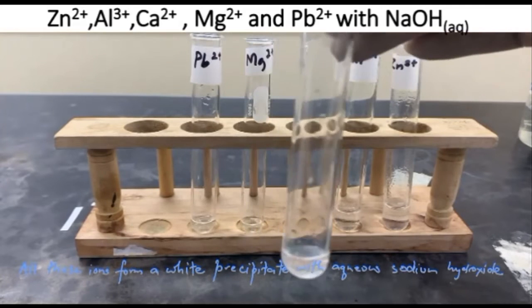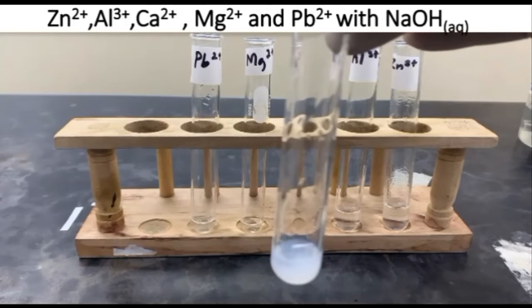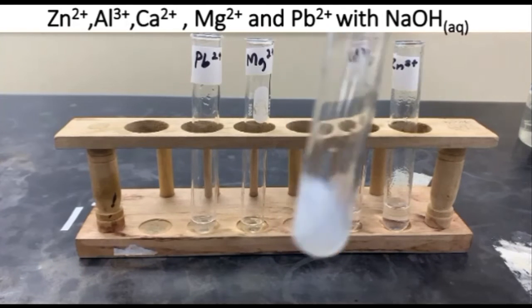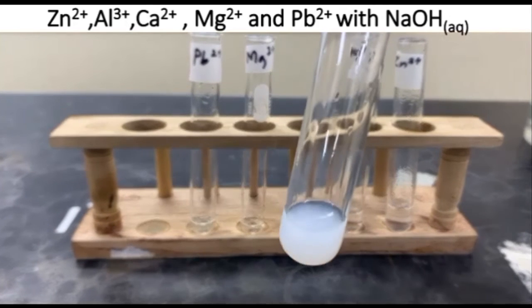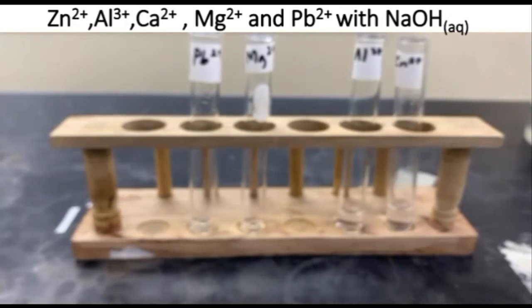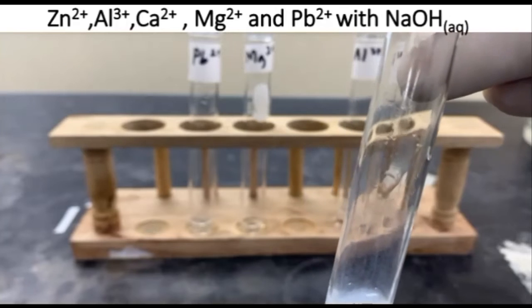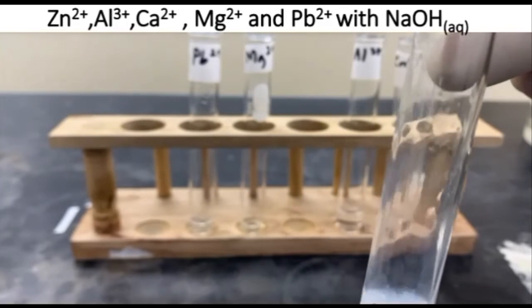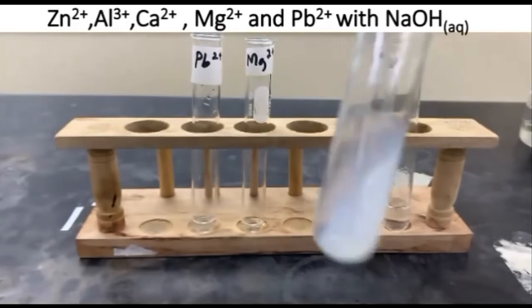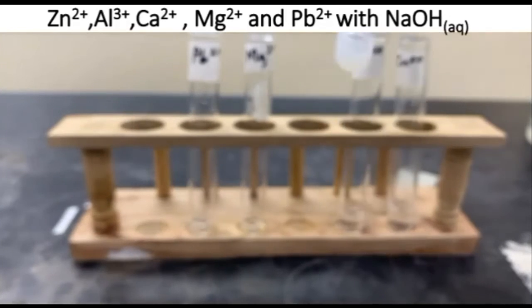Next one up, calcium. So we're going to bring it forward. A few drops of sodium hydroxide, and there we go. We're getting a white precipitate. So we're going to pour off most of the mixture so we can attempt to add our sodium hydroxide in excess. And we're seeing where excess sodium hydroxide is present, our precipitate is insoluble.